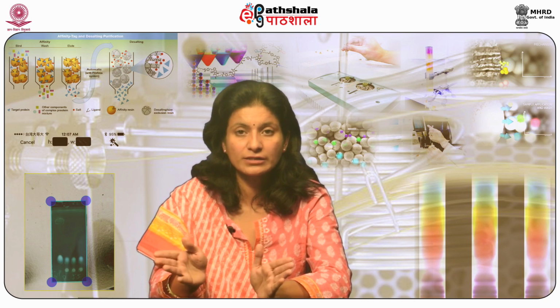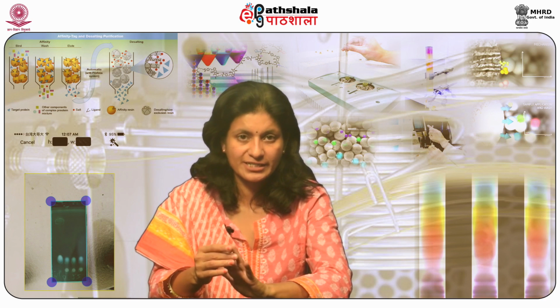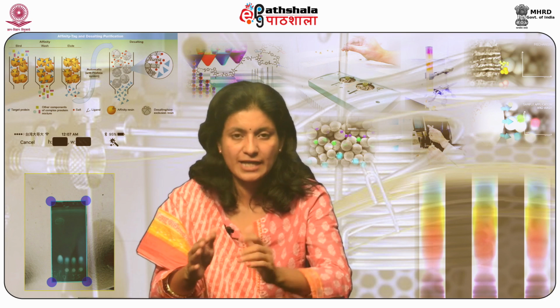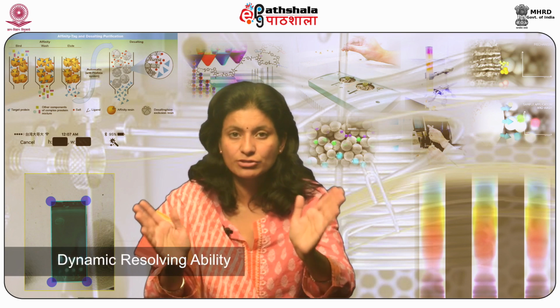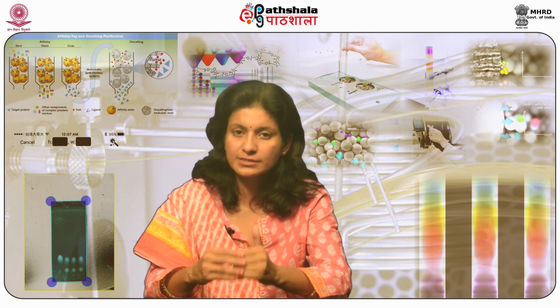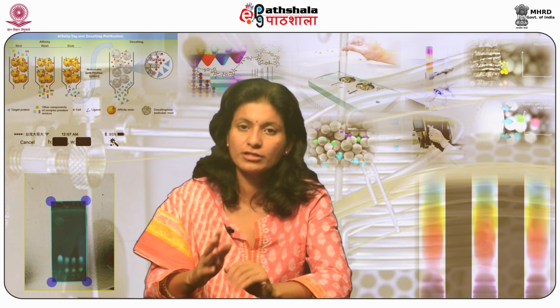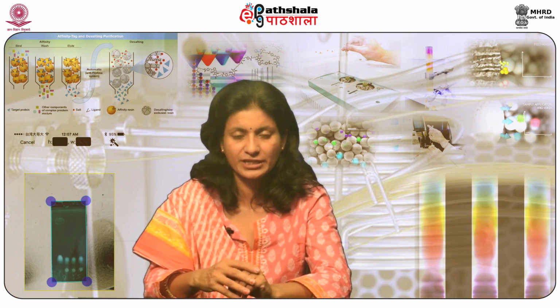Ion exchange chromatography has become one of the chief chromatography techniques as compared to other liquid chromatography approaches because of average cost, huge sample handling capability, easy automation as well as scale-up, dynamic resolving ability, extensive applicability in addition with high throughput application scheme and broad applicability. It can be used at all the phases and proportions of purification.